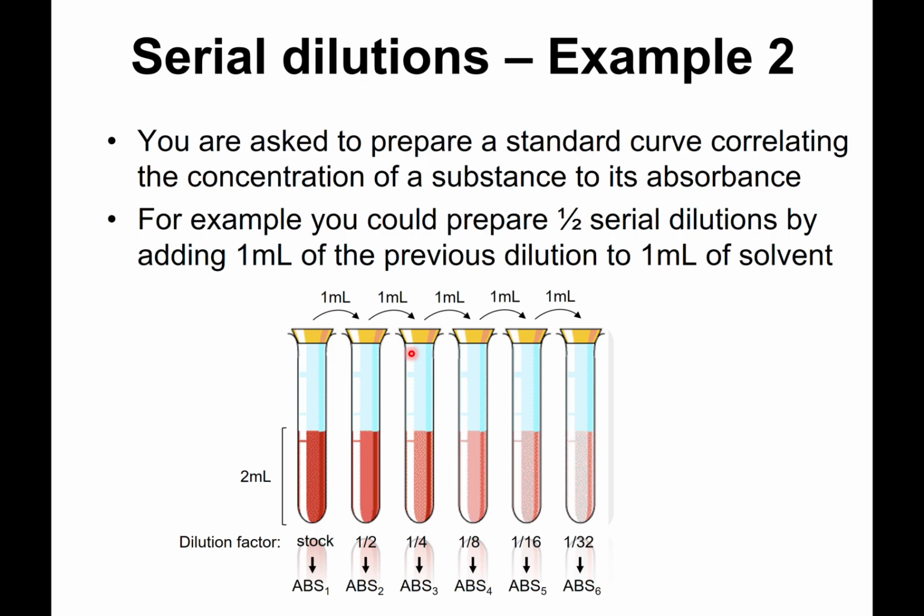Second example, as I said before, sometimes you need to prepare multiple dilutions of the same solute, because you want to test it. For example, you want to prepare a graph that correlates the concentration of a substance with how much light it absorbs at a certain wavelength. Okay, you do it all the time. This type of graph is referred to as a standard curve. So you want to prepare different dilutions?